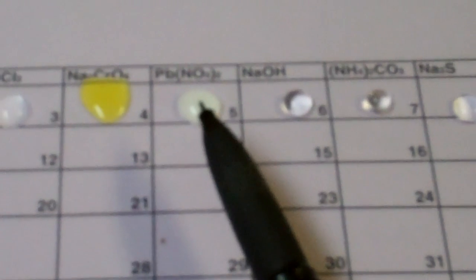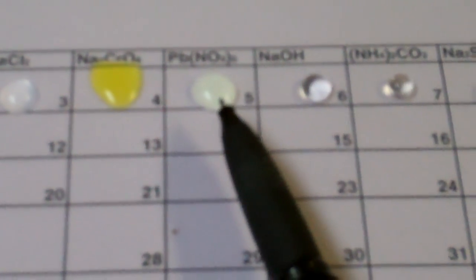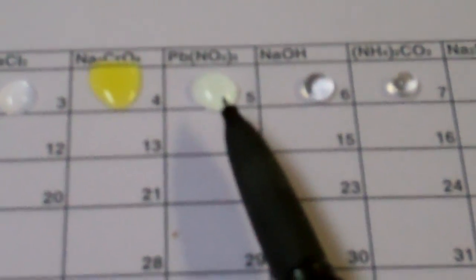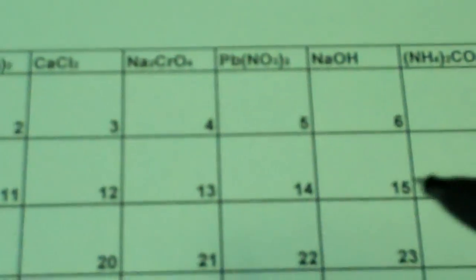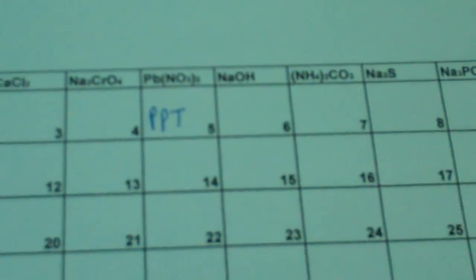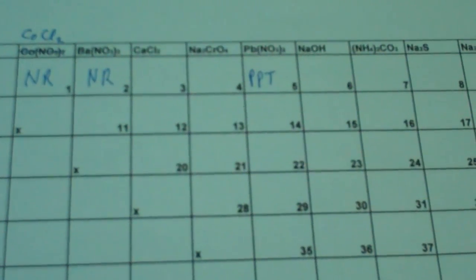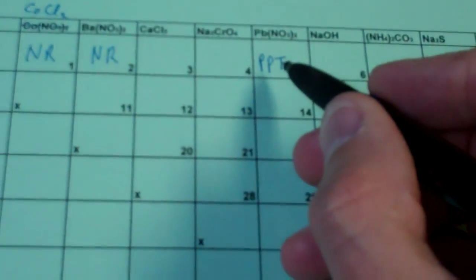Now, in box five, you can see, this is why we do this on purple paper instead of white paper, there is a white precipitate that is formed. They're not always white, but in this case, it certainly is. So, in my data table, on box number five, I am going to write the letters PPT, which will stand for precipitate. So we will know that when we finish the lab report that a precipitate formed in box number five.